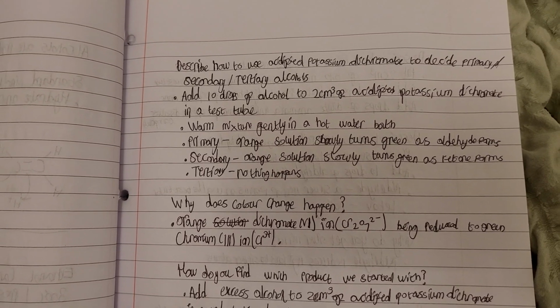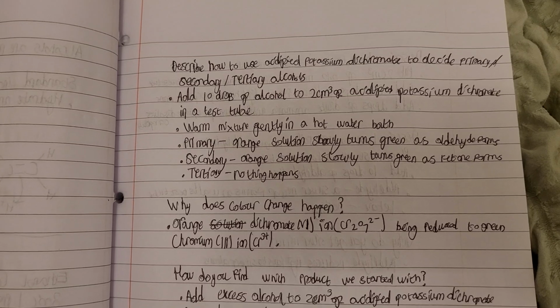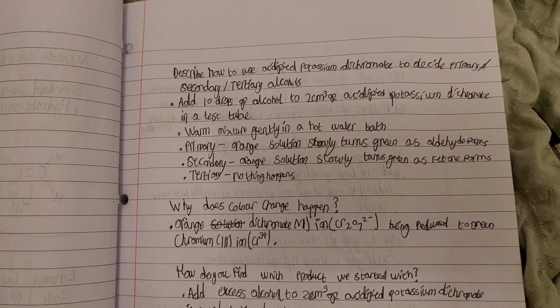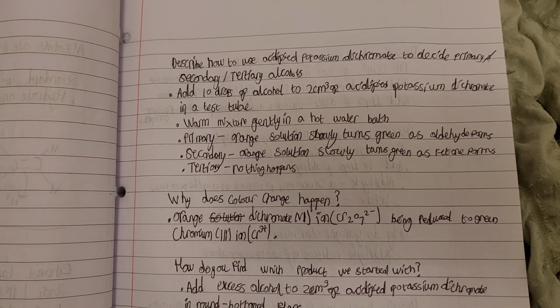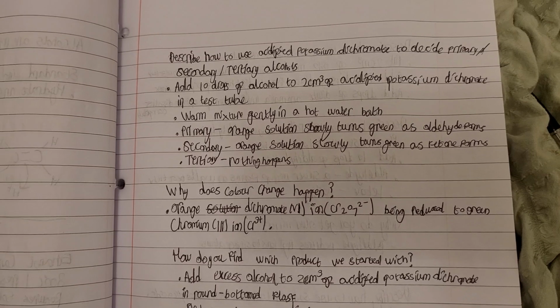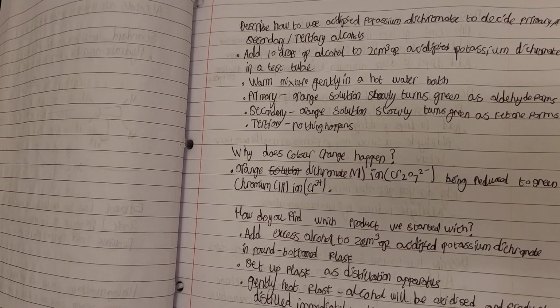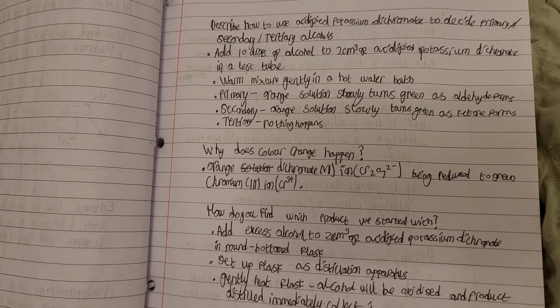First things first, you want to add 10 drops of the alcohol to 2 centimeters cubed of acidified potassium dichromate in a test tube. Then you want to warm the mixture gently in a hot water bath or electric heater. If it's a primary alcohol, the orange solution slowly turns green as an aldehyde forms. If it's a secondary alcohol, the orange solution slowly turns green as a ketone forms. And if it's a tertiary alcohol, nothing happens.